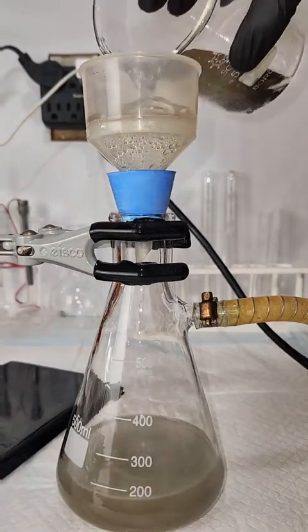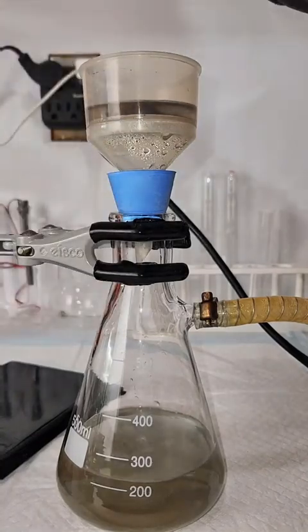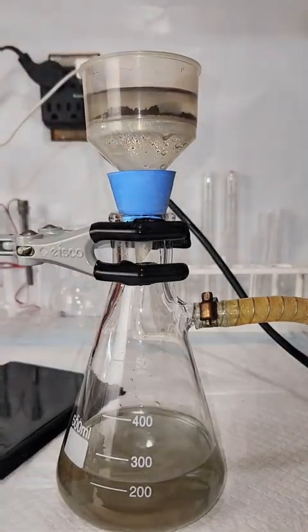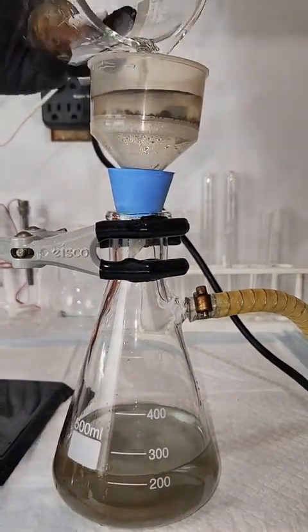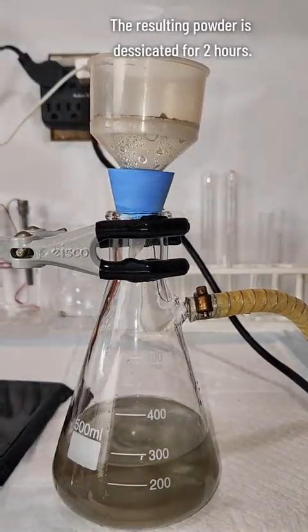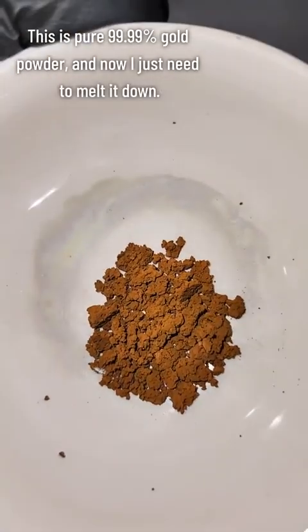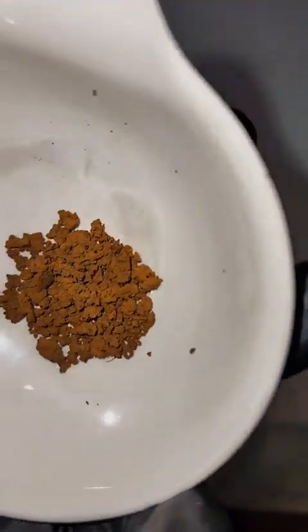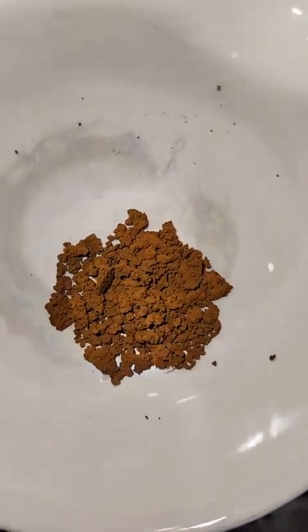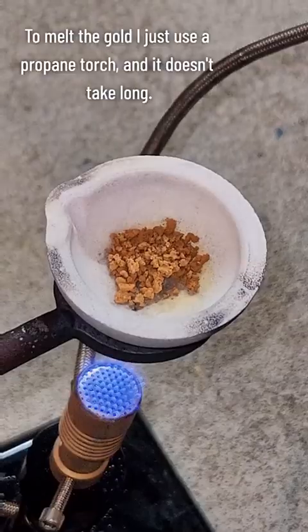The stuff is expensive and I don't want any going to waste. The filter paper is then transferred to a vacuum desiccator where it's dried under low heat in a vacuum for about two hours, and at that point I'm left with a pure, clean, 100% gold powder. Now that I have my pure gold powder, all that's left to do is melt it down — and to do that I just blast it with a propane torch for about 5 minutes.